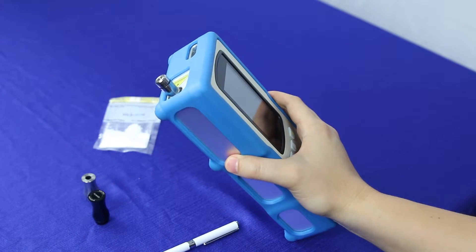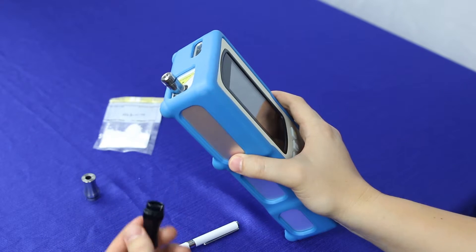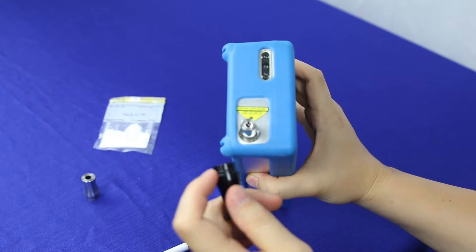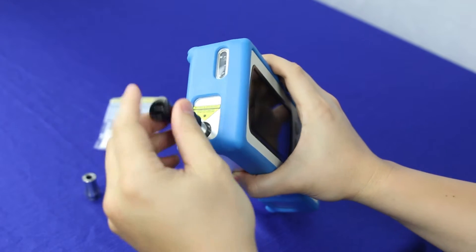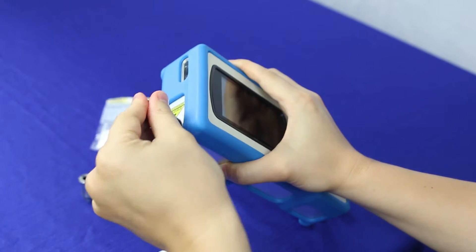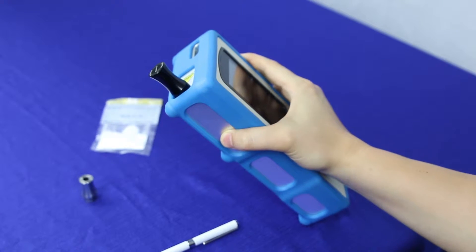When you first boot up your NanoRam, you're going to be asked to perform a calibration validation. To do that, you'll need your polystyrene cap. Take the notch and match it up with the little piece in there. When you put it on, wiggle it around a little bit until you find it, then push it all the way down to make sure that it gets the proper signal.